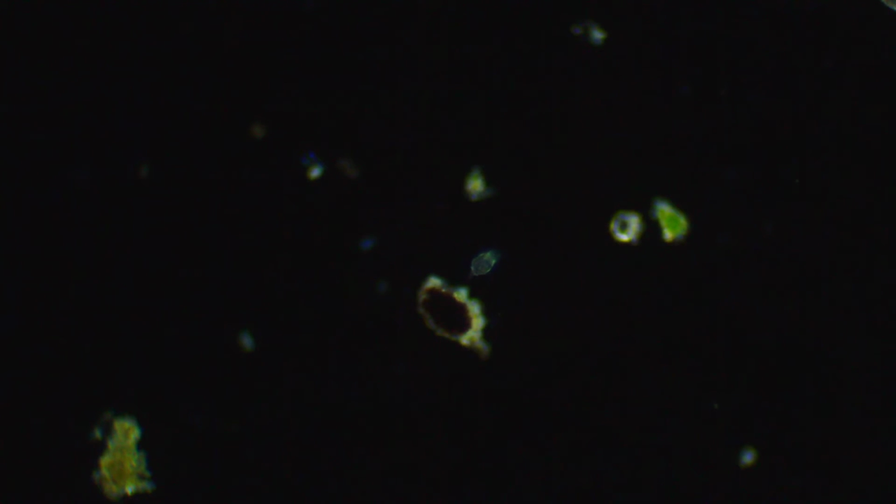I almost missed this guy. This is only the second one I've found, too. He's itty bitty. The other one I found was a little bigger than this. He's so small. I'm on the second objective, and I don't want to switch to the third one because it'll most likely hit the lens. It's a big bulge of water, you know. I'm not using a cover slip.